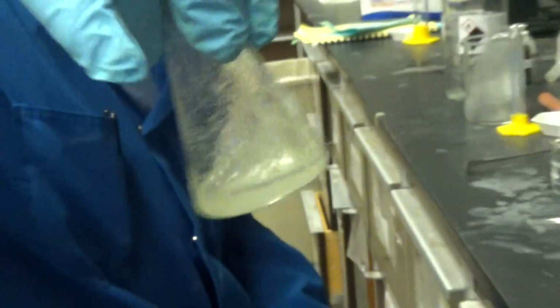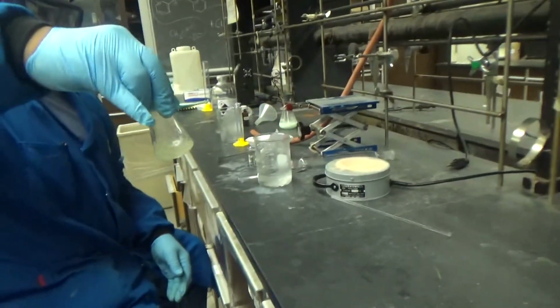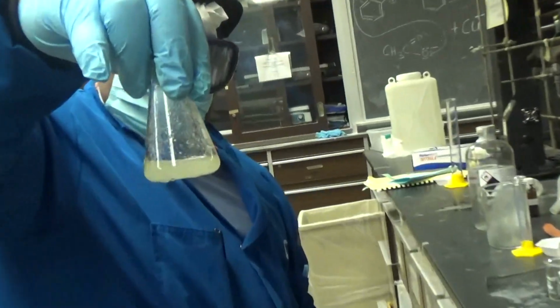Let me see. What do we see here? It looks like we have crystals. Is that crystals? Oh yeah, we do. I can't see it. Where is it? There it is. We have the evidence of crystallized product. Now you can stick it back in there. Back in the ice it goes.